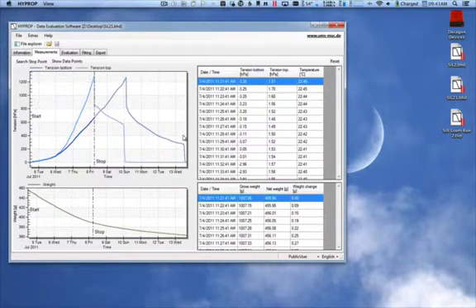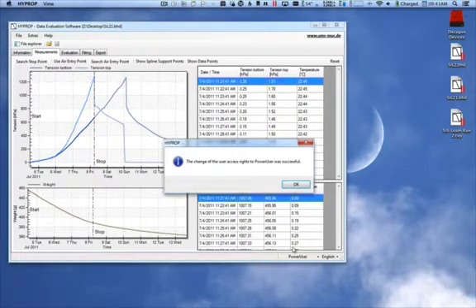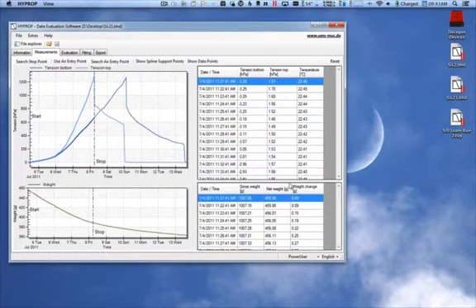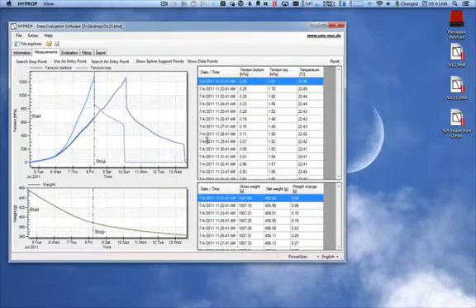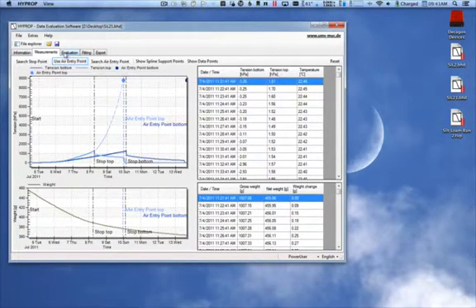To do this, you must change your user settings from Public User to Power User in the bottom right-hand corner. We can then select Use Air Entry Point to use the air entry point of the ceramic.